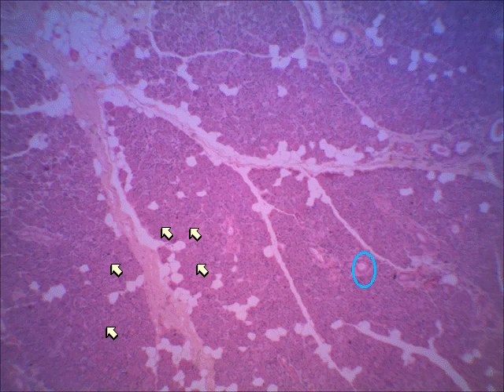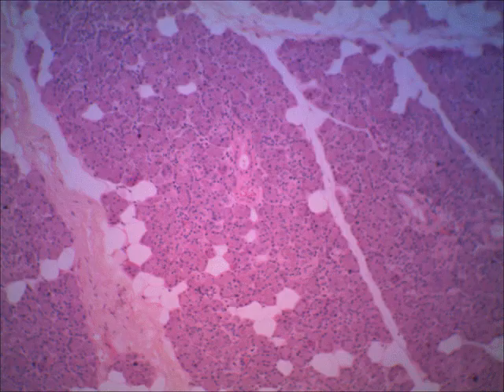When you put it on a higher power, you will actually see the cuboidal cells. Remember from AMP1 that cuboidal cells line ducts? Here's another one up at the top of your screen. So at first glance, this will look quite a bit like a pancreas slide, because the pancreas is another exocrine organ as far as pancreatic juice is concerned. But when we saw it before, we saw it as an endocrine organ. It looked a good bit like this with the addition of some islets of Langerhans, which you won't see on this slide.